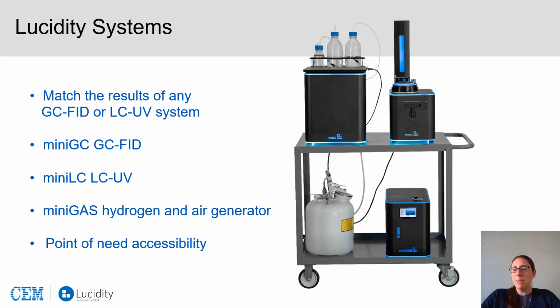And this is kind of an important aspect because one of the big things about these systems is that they are small and very simple to use, and they open up the possibility of point of need accessibility, right? So we don't like to say portable because you wouldn't bring these into the field. They're standard systems, but they're movable. Right? You can put them on a cart, you can put them in a van. There's really options where you can take them to where you need your analysis to take place. And that really opens up the applicability of these types of systems.